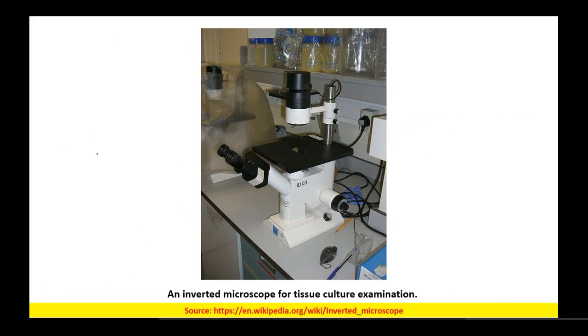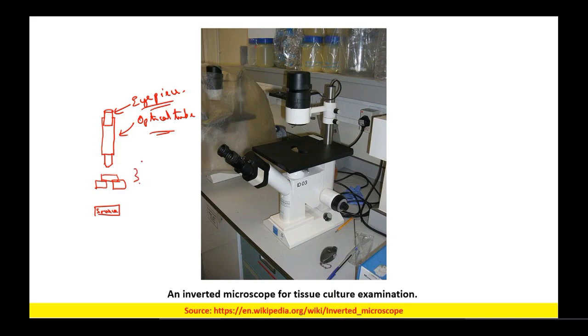Now, till now, I have talked to you about the microscopes, where we have a source at the bottom, then we have the stage. Over that stage, we keep the sample, then we have the objectives, then we have the optical path or optical tube, then we have the eyepiece. In these cases, we are able to take the micrograph of most of the samples.